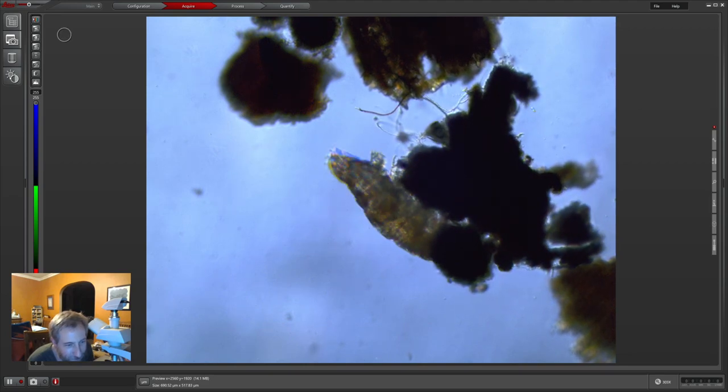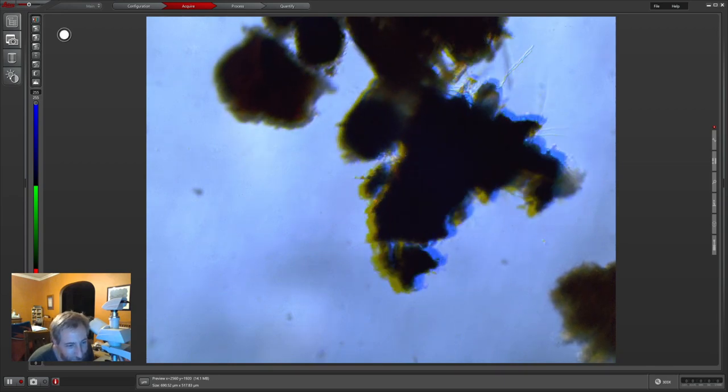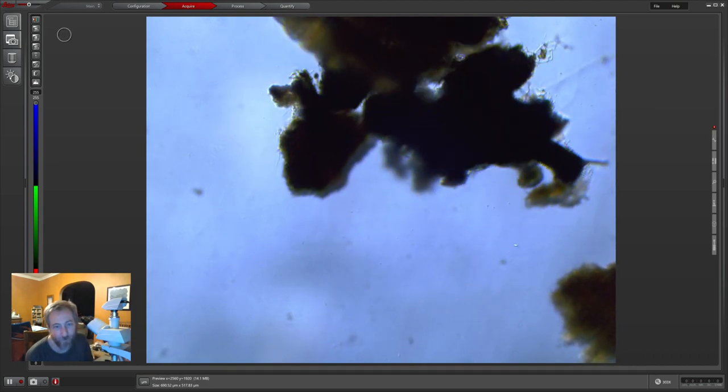Trying to keep moving things in focus is hard. Why are we looking at it? Because we like to look at little things — that's just what we do. I got a microscope.